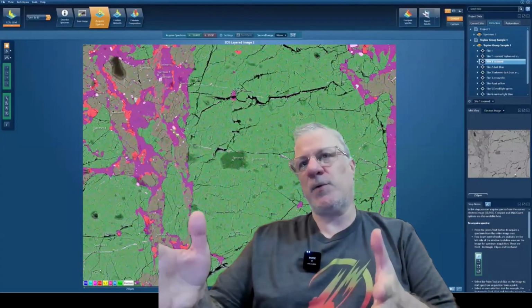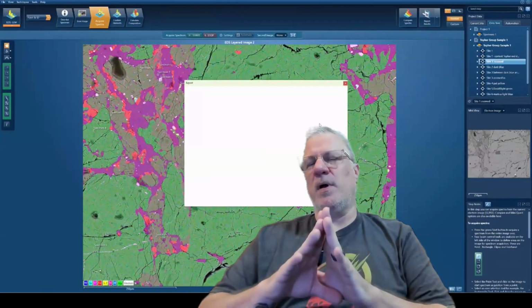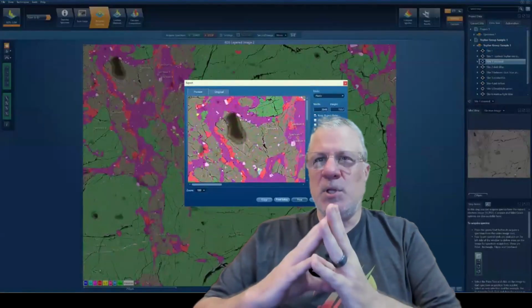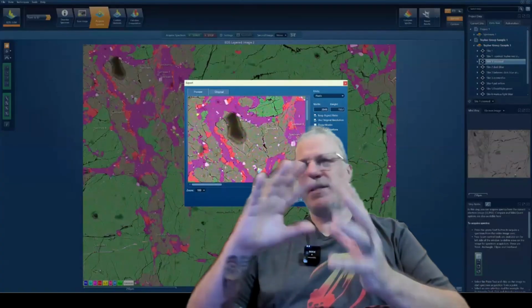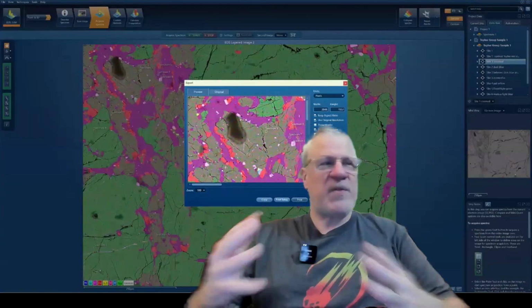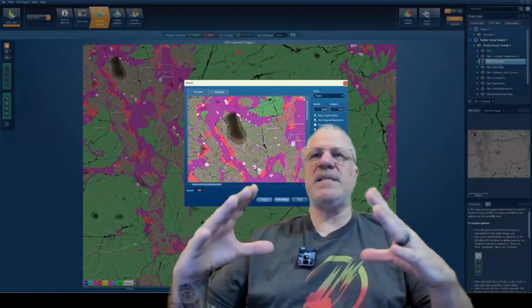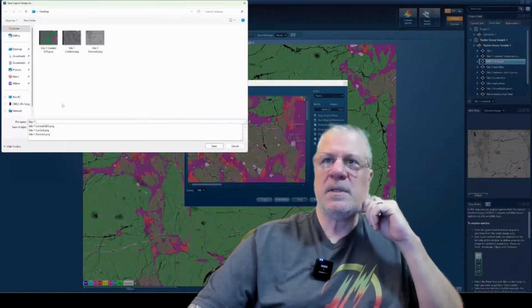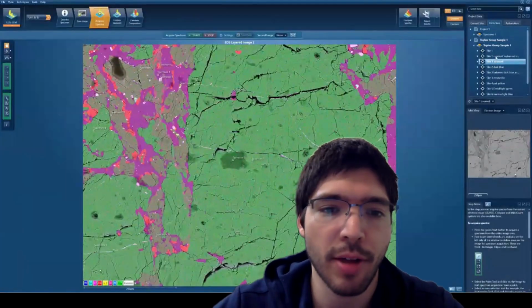The one thing I learned through the process, Daniel, was you wanted to go to where the crystal, the grain, whatever, was the most uniform and big, maybe, rather than the most hodgepodge of colors. Like, oh wow, I'm probably going to get everything in the rainbow if I sample at this weird little spot right here. But you went for places that were more uniform. That's correct. Yeah. The whole goal is, you can have meteorites, or most meteorites, especially most chondrites, are breccias.